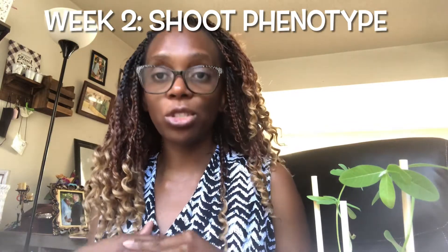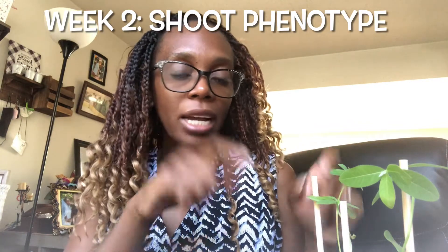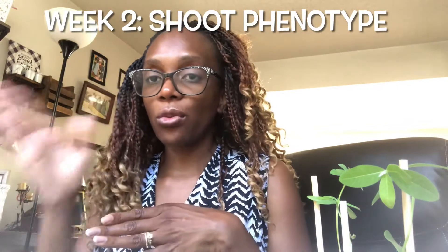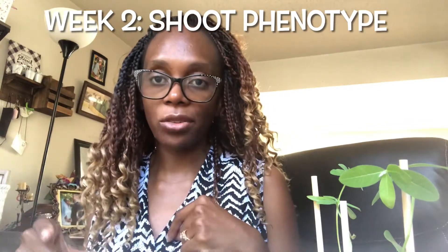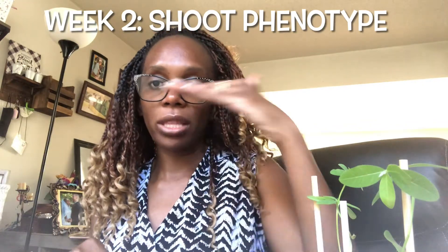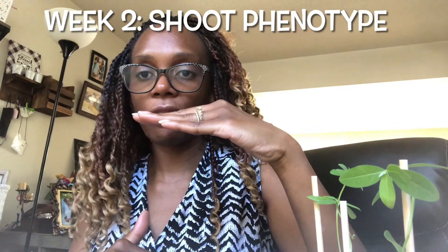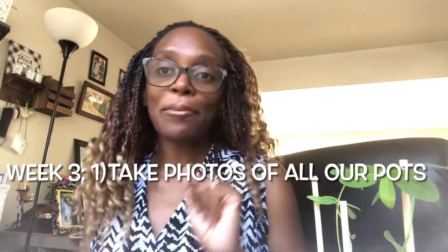In week two we continued taking care of our plants — we watered them and then we started our shoot phenotype. That's where we dug out one plant from each pot, put it on a black surface, got a ruler and a label, and then measured the shoot height — the distance between the top leaves and just above where the root starts.